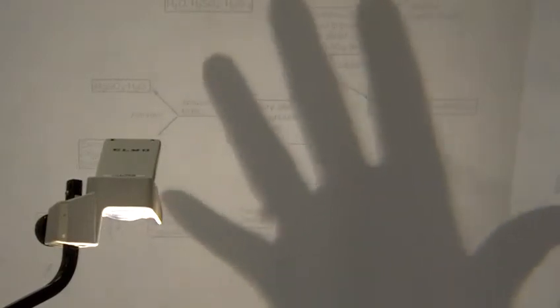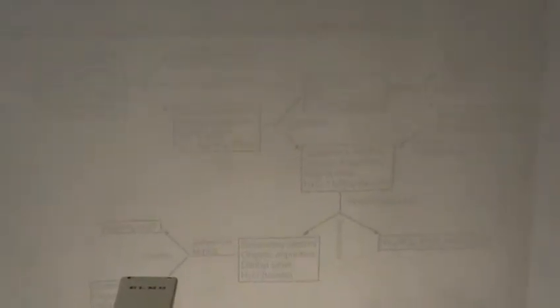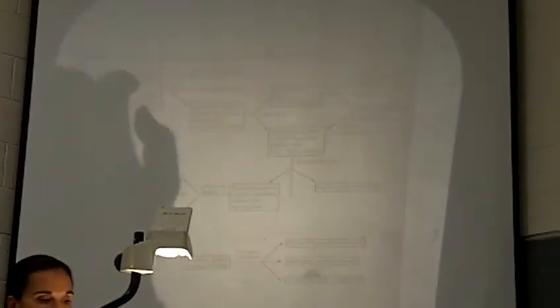So this flow diagram is in your lab manual. This is the flow diagram you want to use for your pre-lab. Okay? Because remember, the flow diagram is always showing the workup of the reaction, and this is the workup we're going to follow. Okay? So we've got our secondary alcohol, organic impurities, diethyl ether, and magnesium in there. And now we're going to start adding the sulfuric acid to quench the reaction and protonate our alcohol. Okay?